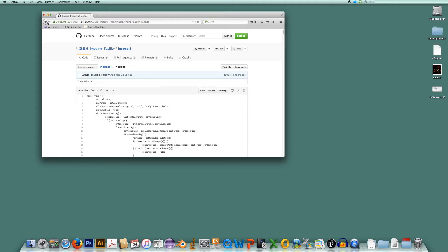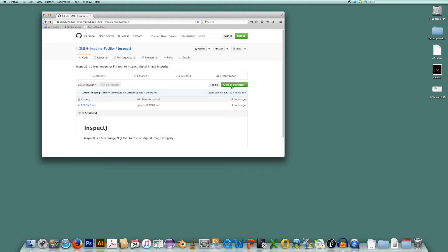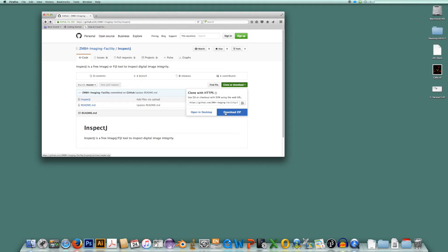Let me go back. If you want to download InSpecJ, just go to this green button over here, clone or download. And I will download zip, this one here. So I click on it.